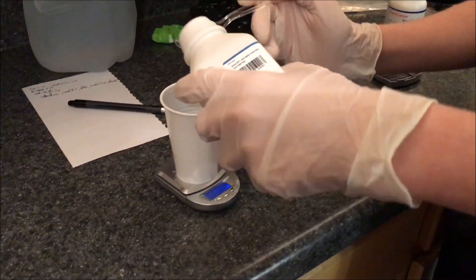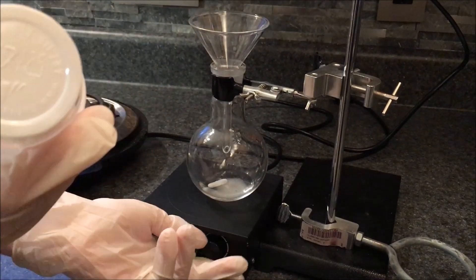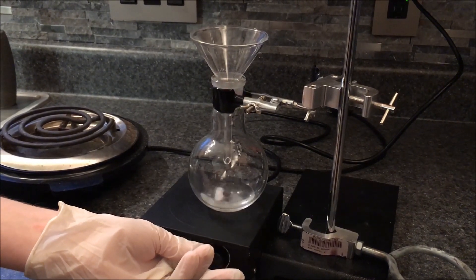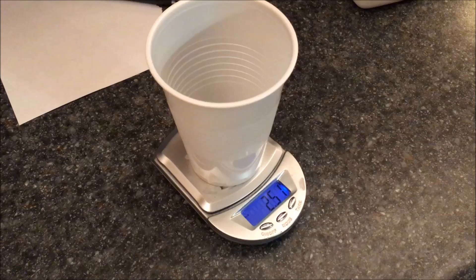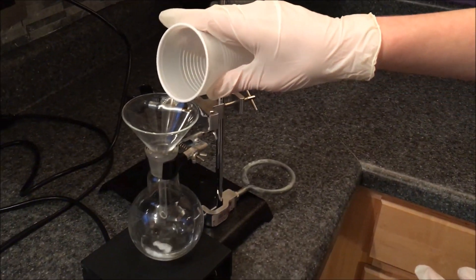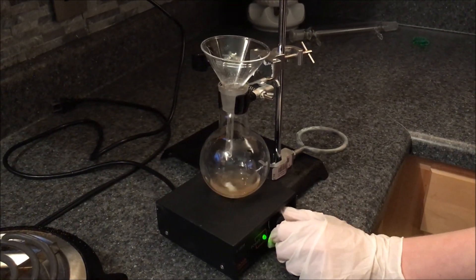To start off, weigh out 1 gram of hydroxylamine hydrochloride and add it to a flask containing 15 ml of water. Weigh out 3.6 grams of sodium acetate trihydrate and add it to the same flask. Then stir the solution for a minute to make sure it all dissolves into the water.